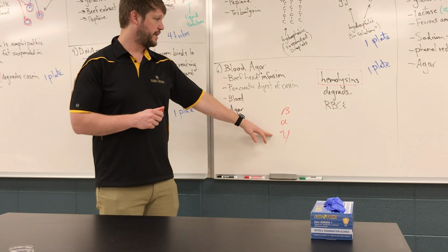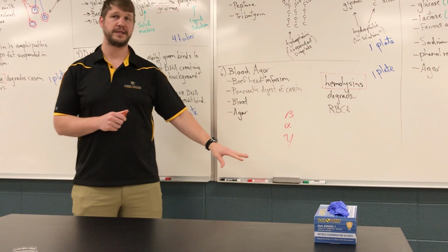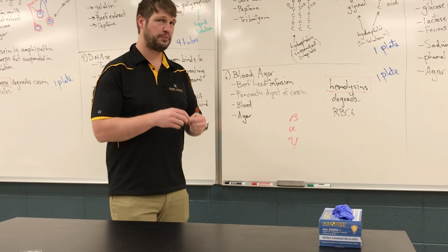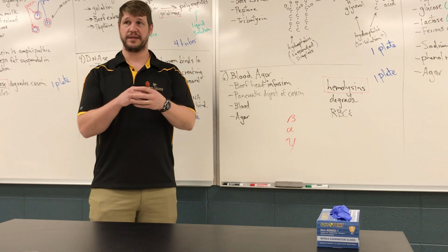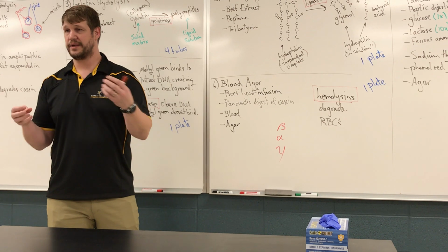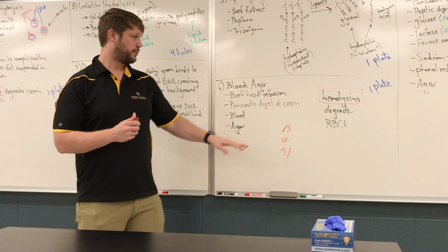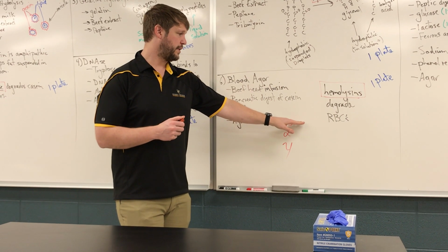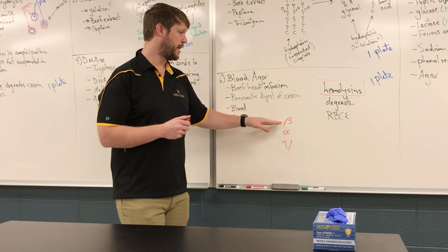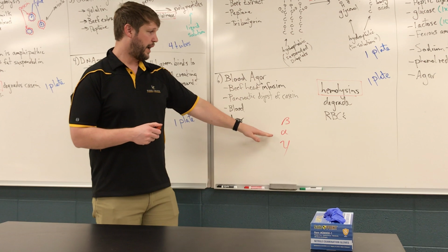And we tend to classify it into 3 types: beta, alpha, and gamma hemolysis. Beta hemolysis is complete hemolysis. The red blood cells are completely broken open. The heme is removed, right? The iron is being scavenged by these microorganisms. And you'll basically get a clear halo around organisms that are capable of doing beta hemolysis.